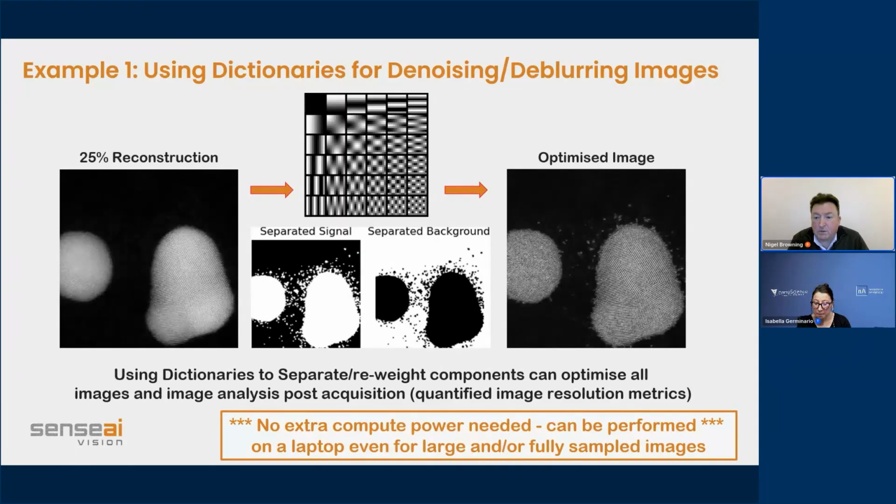Okay, so there are several things that we can do with that. The first thing is that you can acquire the image in a subsampled way. An EELS signal is a one-dimensional signal. So if you had a detector that was basically columns, we can move the image across the spectrum and you end up with a compressed sensing spectrum.